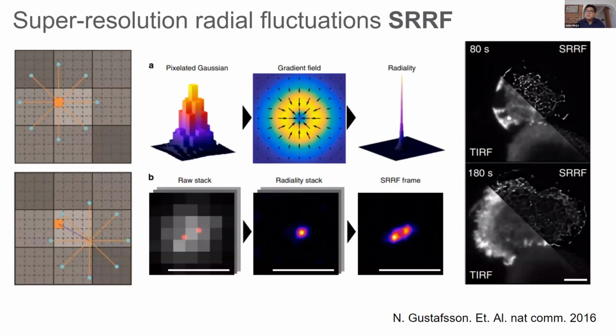In this part, it's important to be clear that we always approximate the punctual sources of light as Gaussian distributions in the intensity. So I hope that it was clear even before I mentioned this. So you manage to reduce this Gaussian distribution of your punctual source of light, and then you have really nice results. So you have these sources that are together, but they overlap and it is already pixelized. You identify the radiality stack, you do the analysis over time, and then you manage to distinguish these two punctual sources.